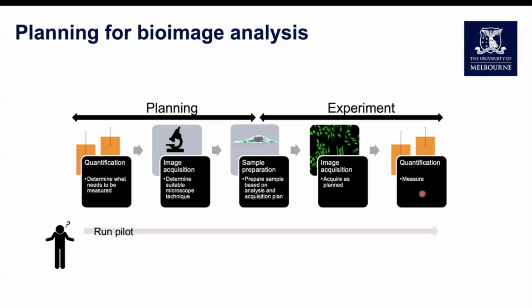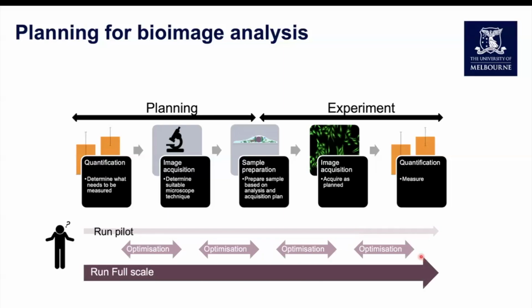One thing that we would suggest strongly is to run through each of these steps as a pilot ahead of doing the final analysis, because what you'll find is you'll often need to go through multiple rounds of optimization for each of these steps to get the entire workflow working properly before then running your full-scale analysis.